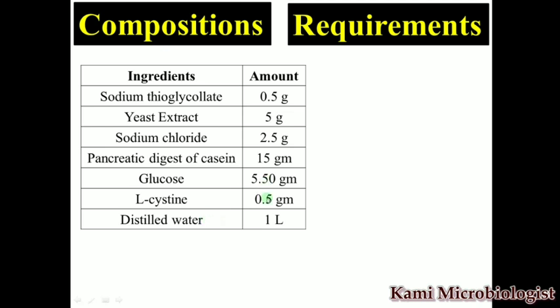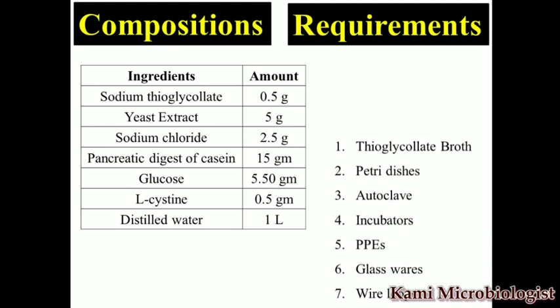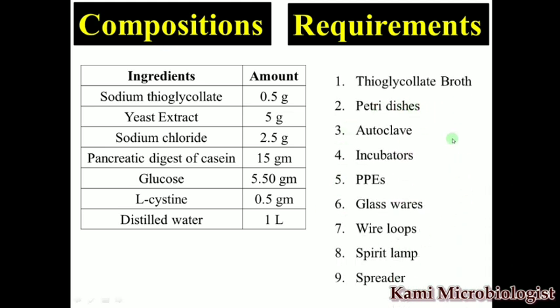We mix all these ingredients in 1 liter, and then we get the thioglycolate broth media. These are the requirements to prepare this media.